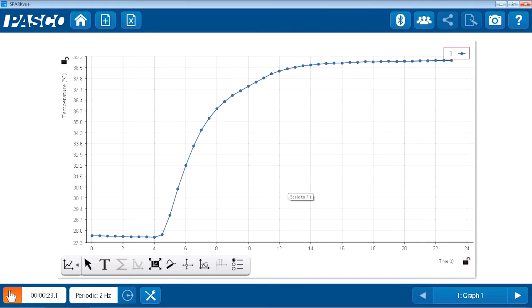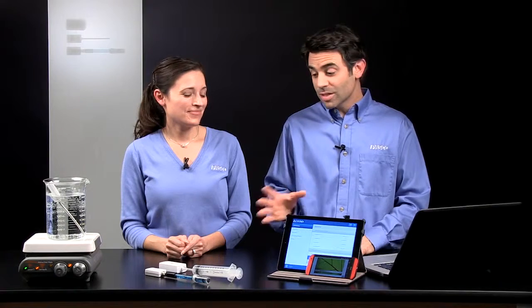Still collecting data. So this is a great start to our wireless sensor line. But there are going to be other sensors to come that are going to address the needs that you have in your physics, in your chemistry, in your biology, and in your environmental classes.